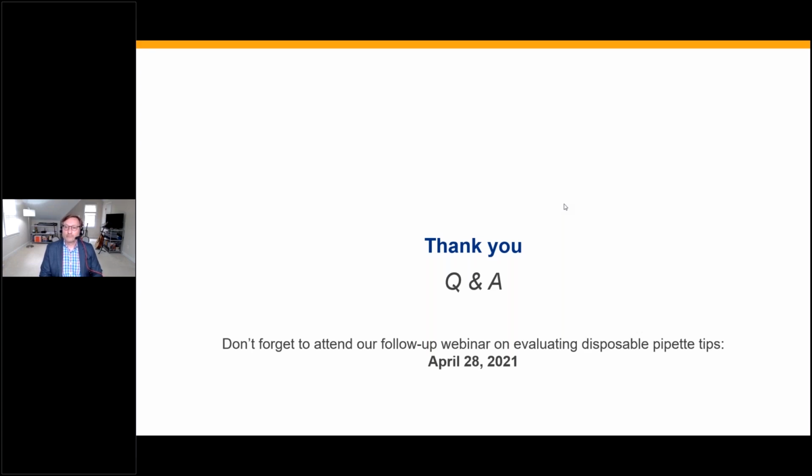Okay, thank you very much. A very non-committal answer. Yeah, I think we've got time for just one more. And it's: how would you go about validating a protocol where multiple source wells are combined in various combinations in various destination wells in an efficient way that represents the protocol?